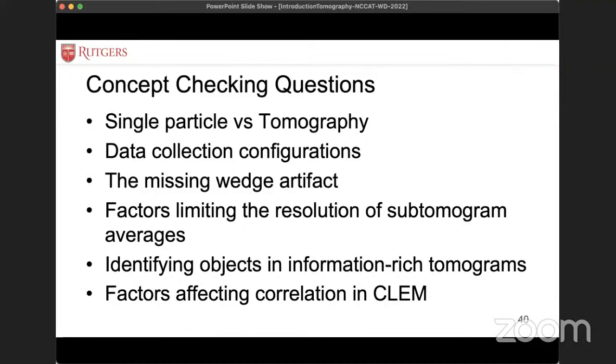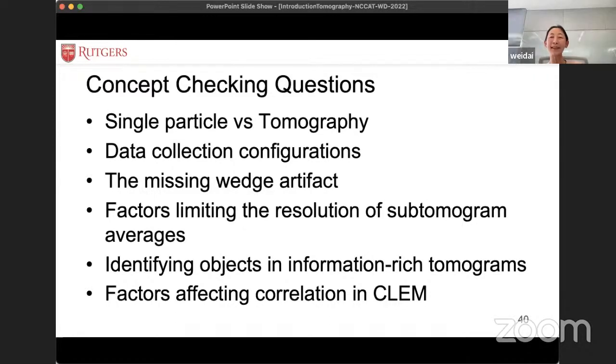Okay, the first one is basically a sample preparation question about buffer. This is a very challenging one, and I can only say it's sample dependent. If you're talking about, for example, a purified protein complex, you probably want to use the buffer in which the complex is most stable, right?